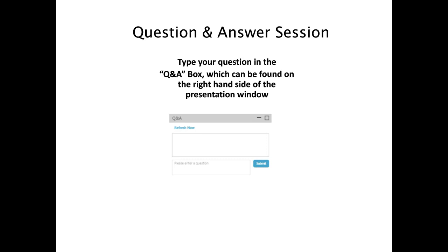So here's another one. How will I know that the Halo column I choose to shorten or speed up a method with will work with my instrument's pressure limit? Oh, that's a good question. What you can do is estimate the back pressure from your Halo column by calculation if you know the flow rate, the column porosity, the temperature, the mobile phase viscosity, and the column permeability. There are tables of mobile phase viscosity depending on the temperature, and those parameters aren't too hard to get.